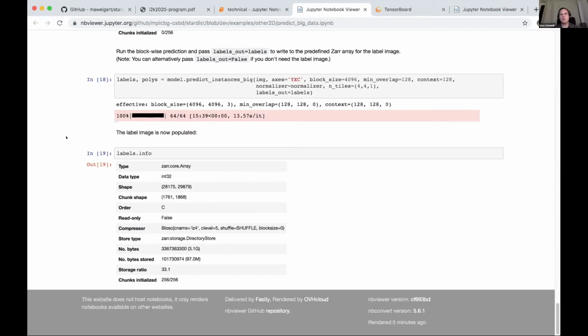Yeah, so pre-training definitely makes sense. And ideally, we would have a notebook that also shows you how to do this, right? It's definitely possible because you have full access to Keras. Keras is the neural network library that we use under the hood, and there you have full control to freeze layers and so on. You can change everything you want. The base model that I described is just an outer wrapper over the standard Keras model that you have full control over. So you could mix that.